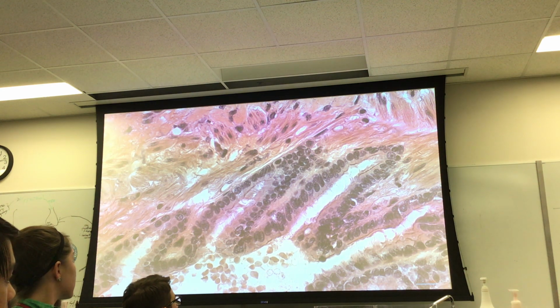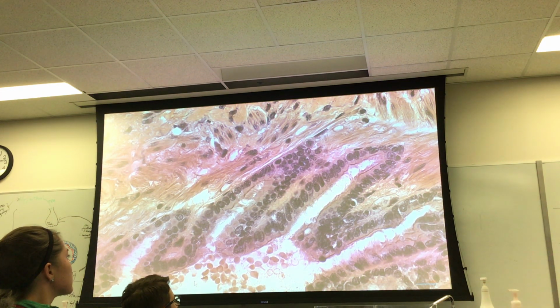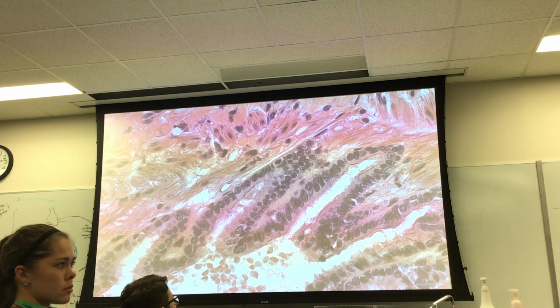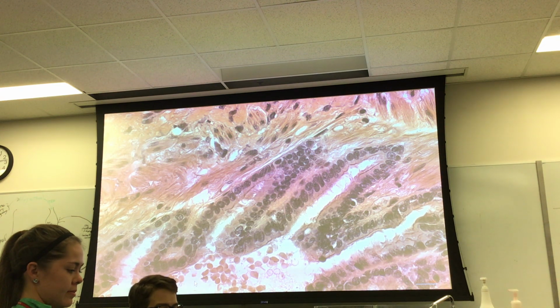I'll start you off. The pointer's in the lumen right here. What is the tissue type that lines that lumen? Now, this is a rhetorical question. You don't have to yell these things out. So I want you to think about this a little bit.